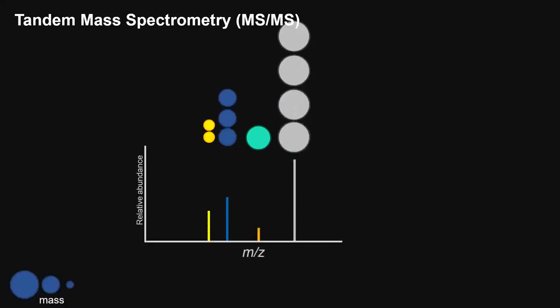And again, the abundance says something about the stability of this ion, for example. So if we see something like this, it means that the fragment is more stable than maybe some smaller ions. And then of course, if you use higher energy, maybe you shift it to some other smaller masses. Maybe you lose some of the higher ones, because then you also break those into smaller pieces. And then with this information, we actually know more about the structure.